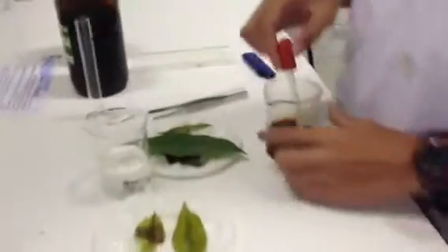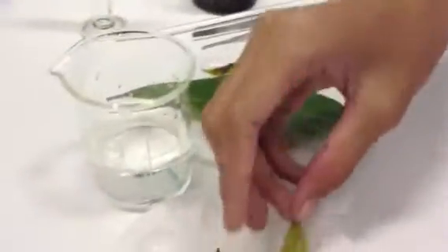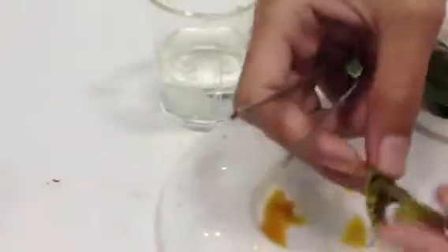Conclusion: After dropping iodine solution, the color of the leaf will change to black and blue, because the leaf has starch.